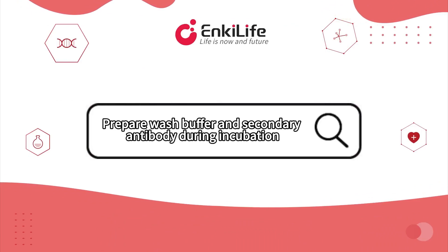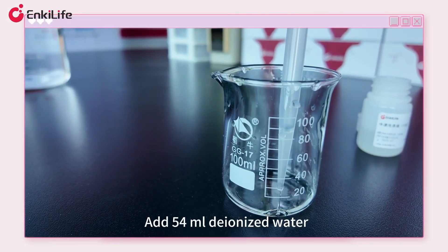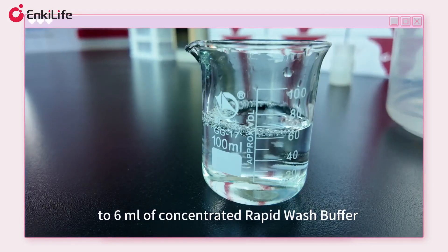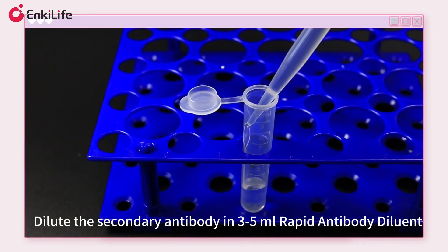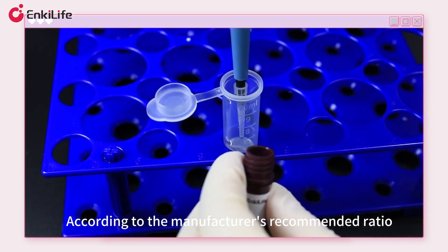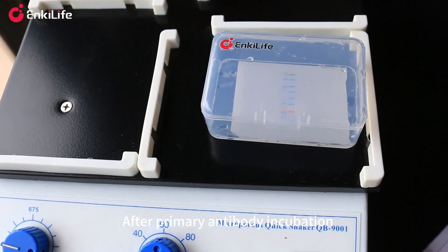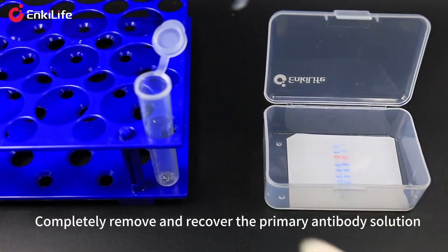During incubation, prepare wash buffer and secondary antibody. Add 50 milliliters of deionized water to 6 milliliters of concentrated rapid wash buffer. Dilute the secondary antibody in 3 to 5 milliliters of rapid antibody diluent according to the manufacturer's recommended ratio. After primary antibody incubation, completely remove and recover the primary antibody solution.